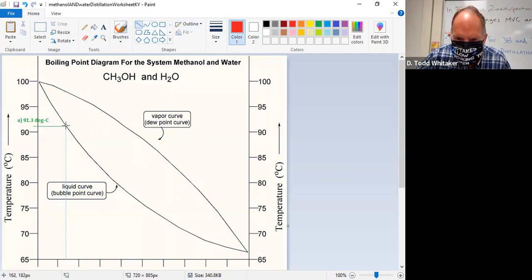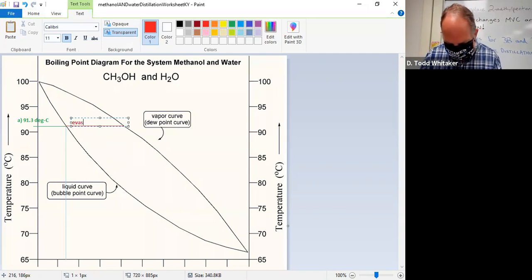Going from here straight across until the liquid becomes, and I gave the answer away by mistake, vapor. Paint has this nice feature that there's a little crosshair where the line leaves off. 1+. Okay, so that is evaporation number 1, isn't it? Evap.